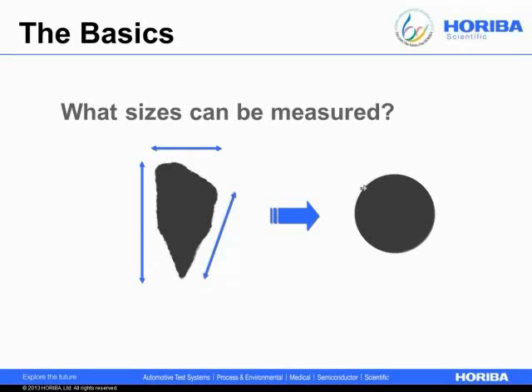So that naturally brings a little bit of error into the process, but that's okay. We don't get worried about that error because it's built into every measurement. And really what you want to know much more often isn't the absolute accuracy of the size that's being reported, but the relative accuracy.